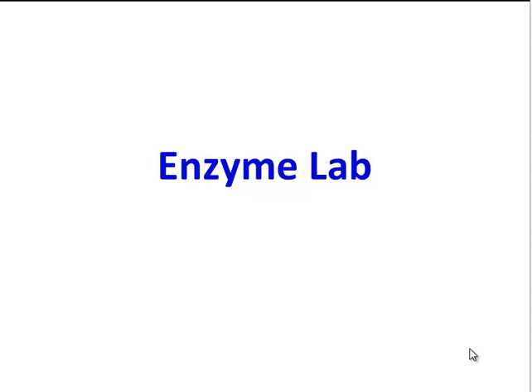In this video, you'll learn a protocol for testing enzyme activity, so make sure you're setting up your lab notebook as you go. Just a little background information.